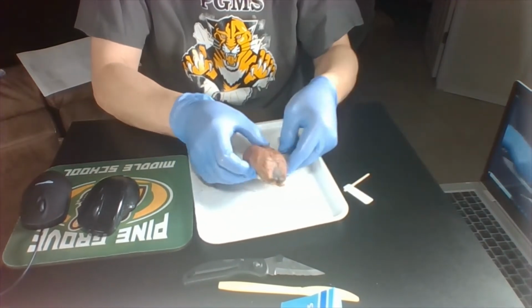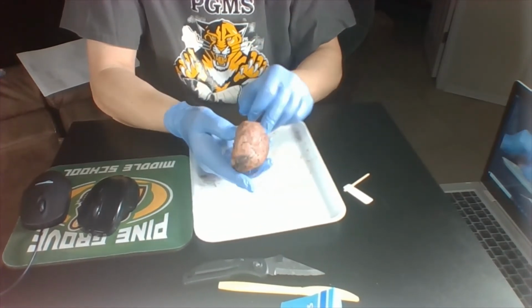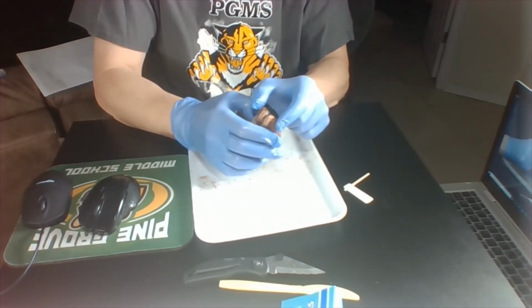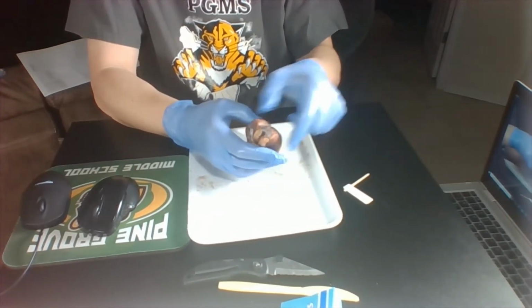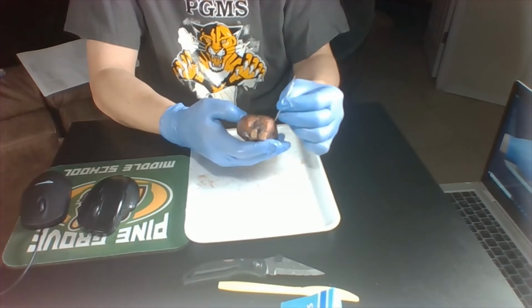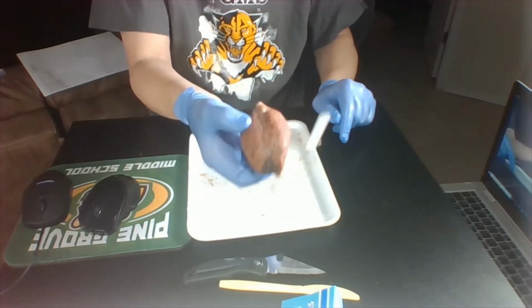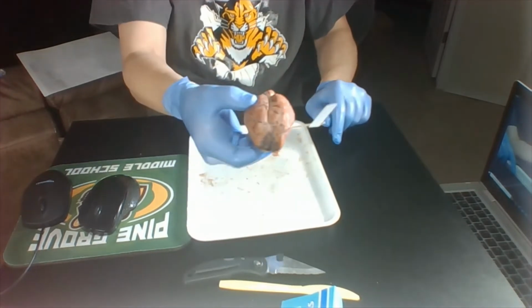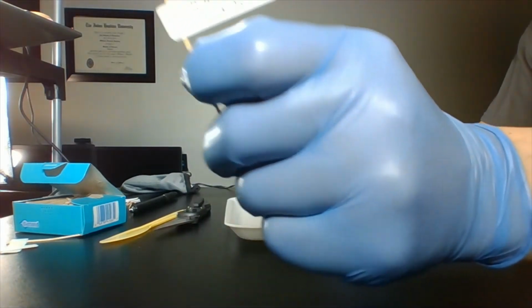So remember the sheep brain, the brainstem is in the back. And again, I'm just trying to show the angles here. So the nose would be right here in the front. The eyes would be here on the side if you're picturing the sheep's head. So the temples are on the side of the head, just like ours are. So the temporal lobe would be right here on the sides. And there's a top view. So, temporal lobe.